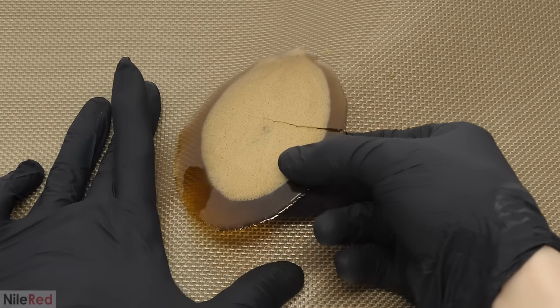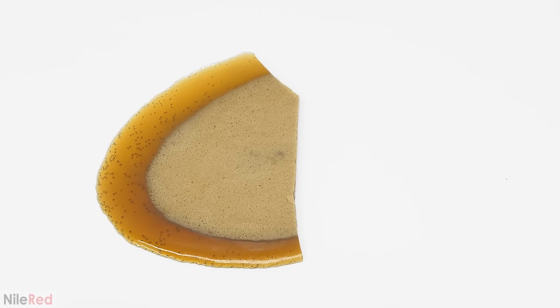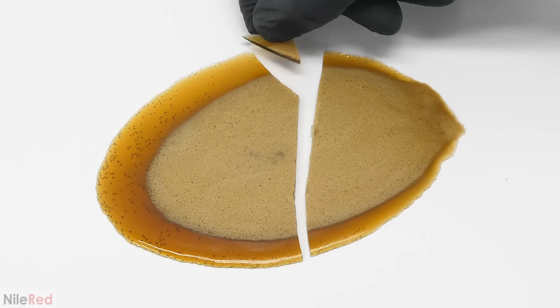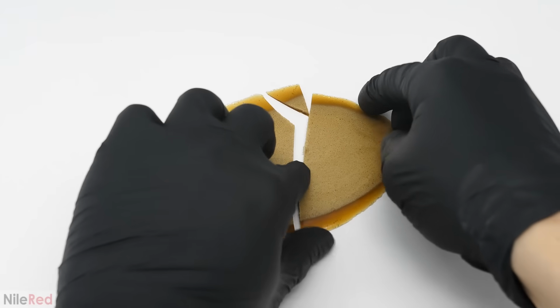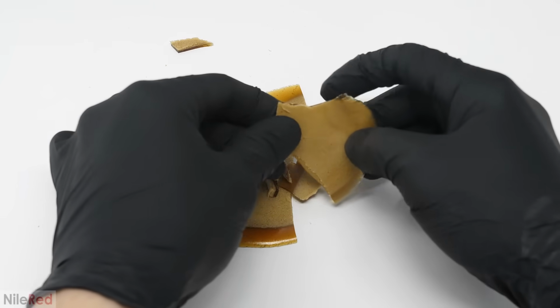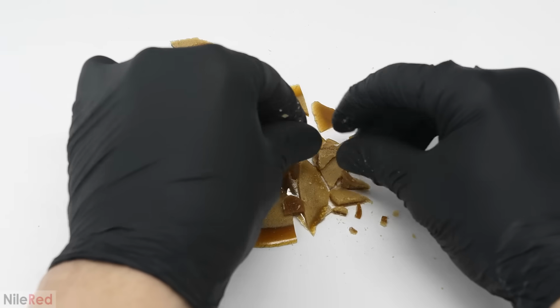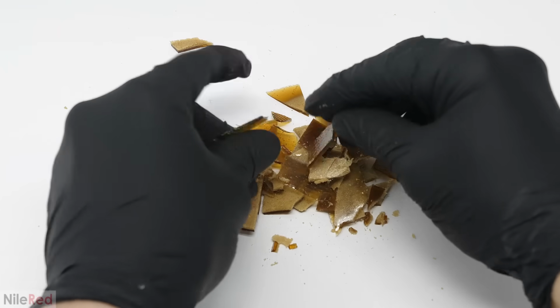However, the yield was technically kind of crappy, and I only got about 20 grams. In theory, I probably should have gotten at least 50. This meant that I had lost a lot along the way, and I honestly have no idea where it went. I'm thinking that a lot of it might have gotten trapped in the exchange resin or in all the calcium sulfate. Or maybe, in general, the process just wasn't super efficient. Either way, I never expected this process to be amazing, and 20 grams was more than enough.